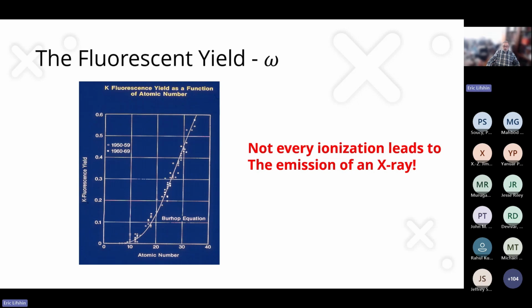But before I leave this slide, let me mention that not every electron leads to an ionization. When we talk about the regular operation of a scanning microscope, we know that the backscatter fraction could be as high as, say, 50% if we're bouncing electrons off of gold. It's not much of a function of the beam voltage; it's high. Secondary electrons are less, but our detectors are more efficient, and we can get a lot of signal.